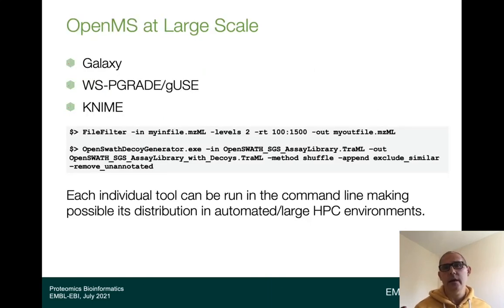Unless you use KNIME as the desktop tool to build your workflow, you can run this in the command line.